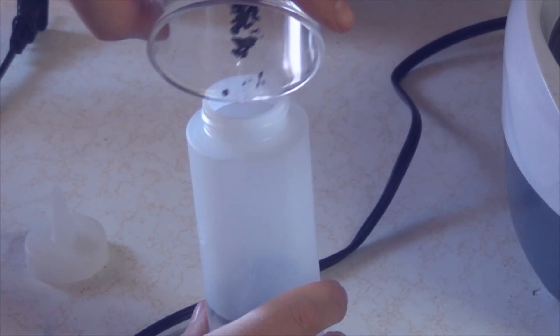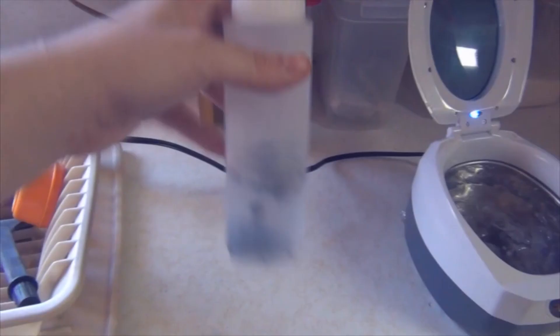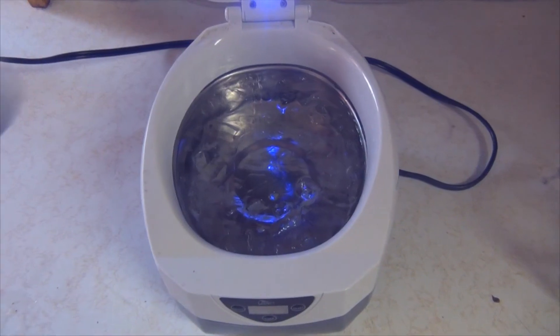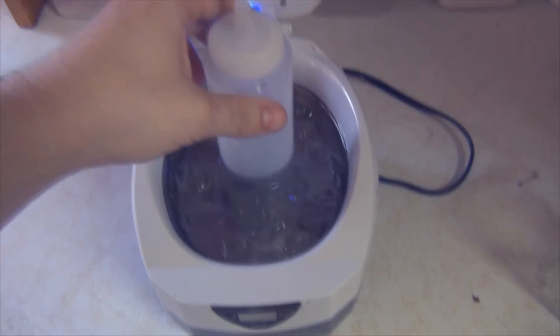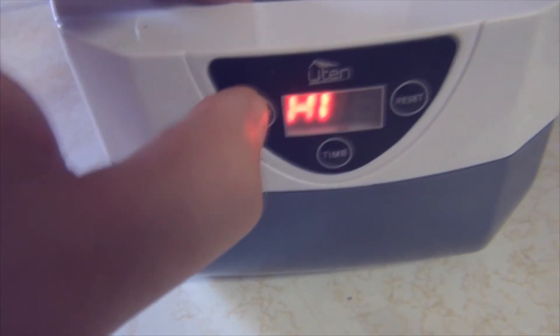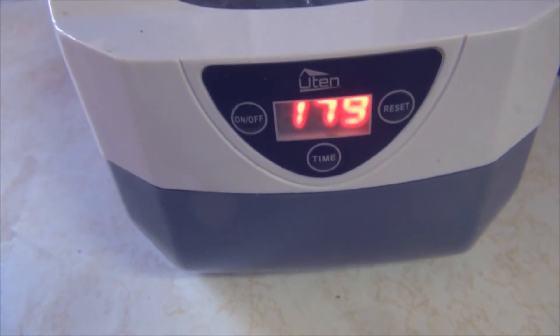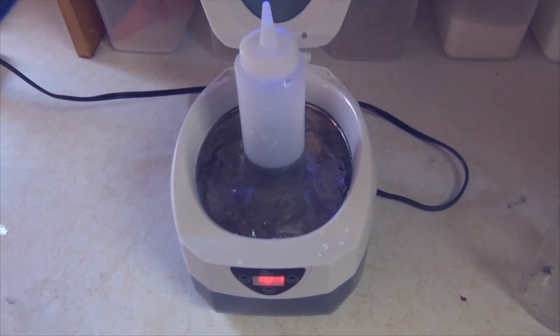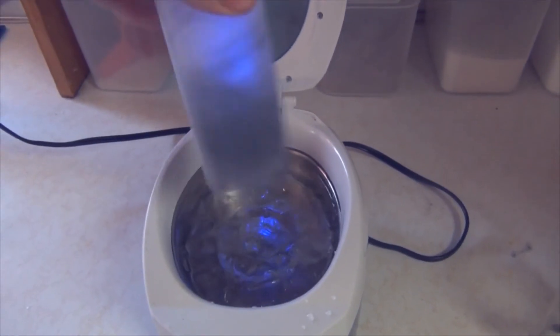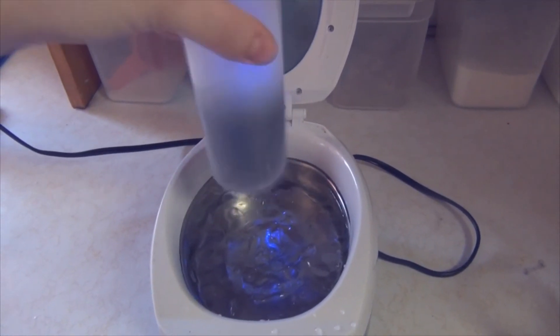Transfer the graphite nanoplatelets into the container. Give everything a good mix since these particles don't mix well and you want to break them up. Add it into the ultrasonic cleaner and start the ultrasonication process. Do this for about 30 minutes, and periodically pick up the container and shake it to help break up the particles.